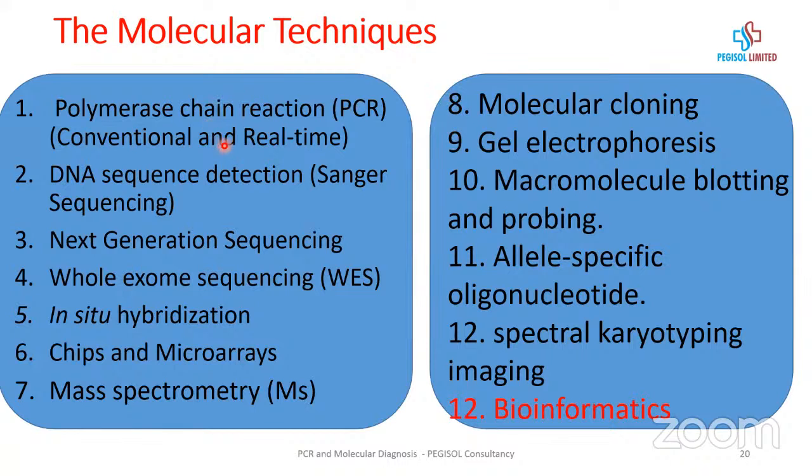So the one we've talked about now is the polymerase chain reaction, which is a conventional reaction. Someone is going to give you a lecture on PCR, but I try to give it from the beginning, because if you understand that, any other lecture that you're going to get on the real content of PCR, the difference between real-time and conventional PCR, you will be able to grasp.